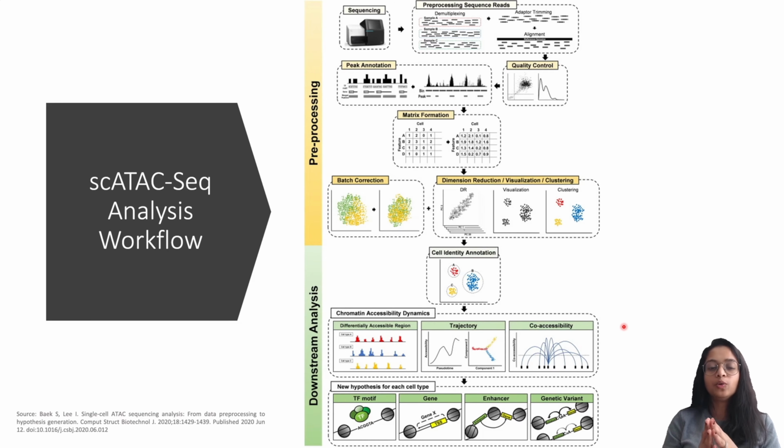Like, it is common to integrate single cell ATAC with single cell RNA, which can give us additional evidence, in terms of the ATAC giving us an idea on the regions of open chromatin, and the gene expression giving us further evidence of those genes in those specific regions being expressed. And this can be compared between different cell types across conditions.